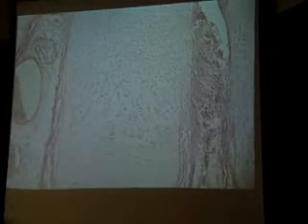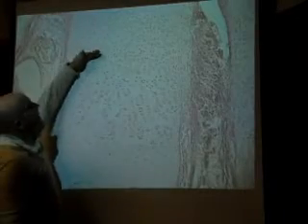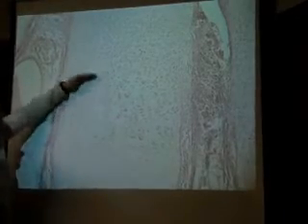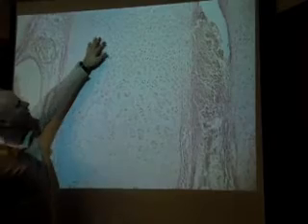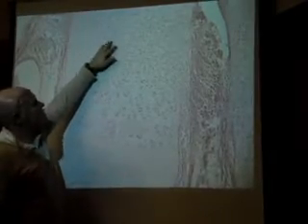And when I move up, what you see there right at the top, so you notice how the tissue up here is different from the tissue in this area here. This is a zone of resting cartilage up here. So that is the zone of resting cartilage. And then as you can see here, those chondrocytes are going to space out just a little bit. And so this area right here, which looks different from this area, this is a zone of proliferation.